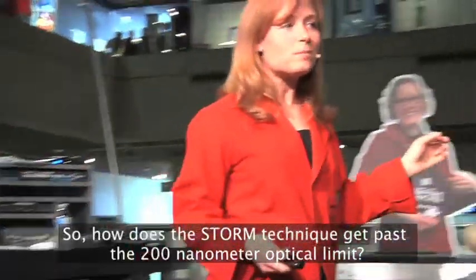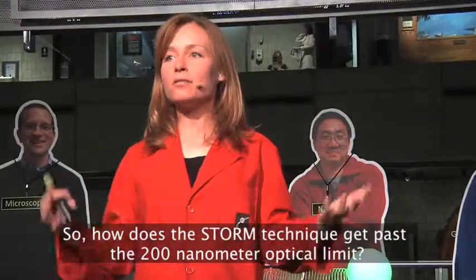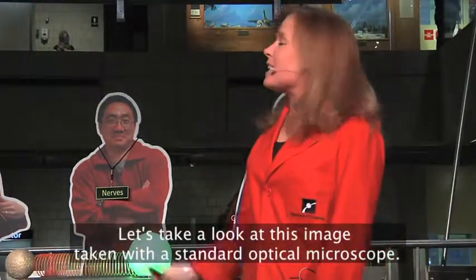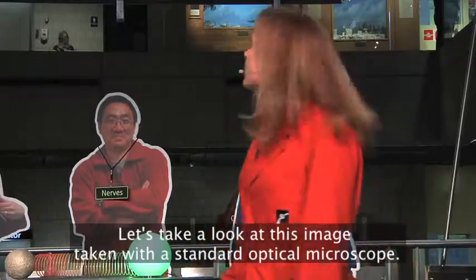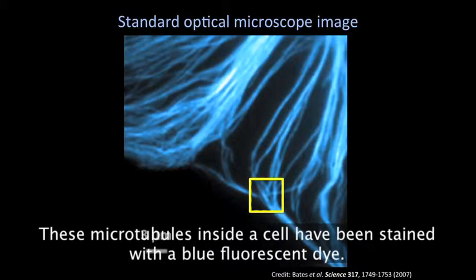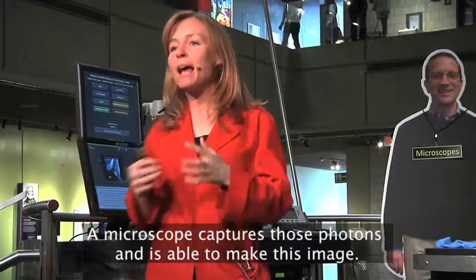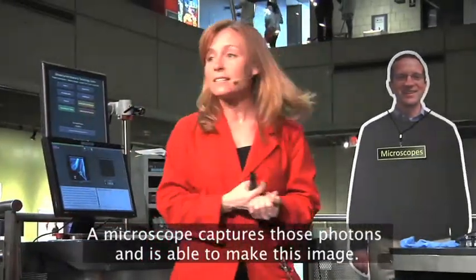So how does the SToRM technique get past this 200 nanometer optical limit? Let's look at this image taken with a standard optical microscope. These microtubules inside a cell have been stained with a blue fluorescent dye. That blue fluorescent dye gives off light in the form of photons. A microscope captures those photons and it is able to make this image.